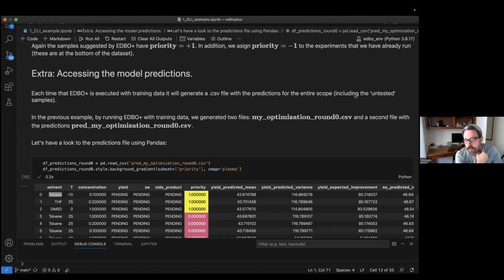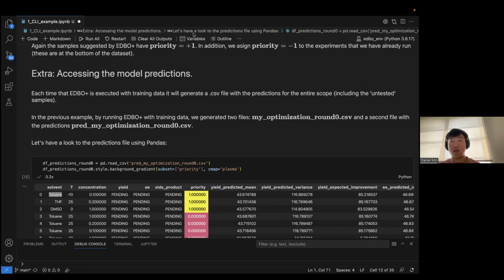I'm going to interrupt here for a second. The work we've done with Daniel and Abby is impressively fast on one of the more challenging aspects. The search space wasn't massive, but we had limited it based on a first round or two of a traditional optimization. But it took 4 rounds to double the yield and improve the selectivity by almost a kcal per mole. So pretty quick. And that was only 20, 30 experiments, right, Daniel? Yeah, it's 5 rounds, 5 experiments per batch. From doing reaction optimization for a very long time in my life, 25 experiments isn't very many.